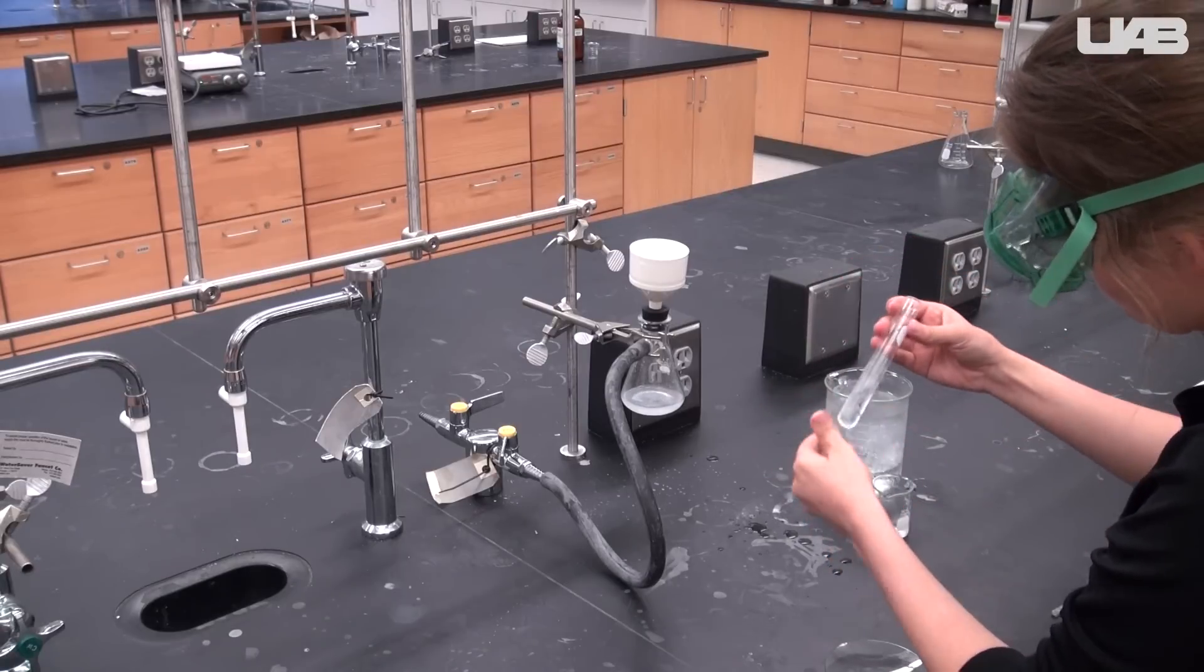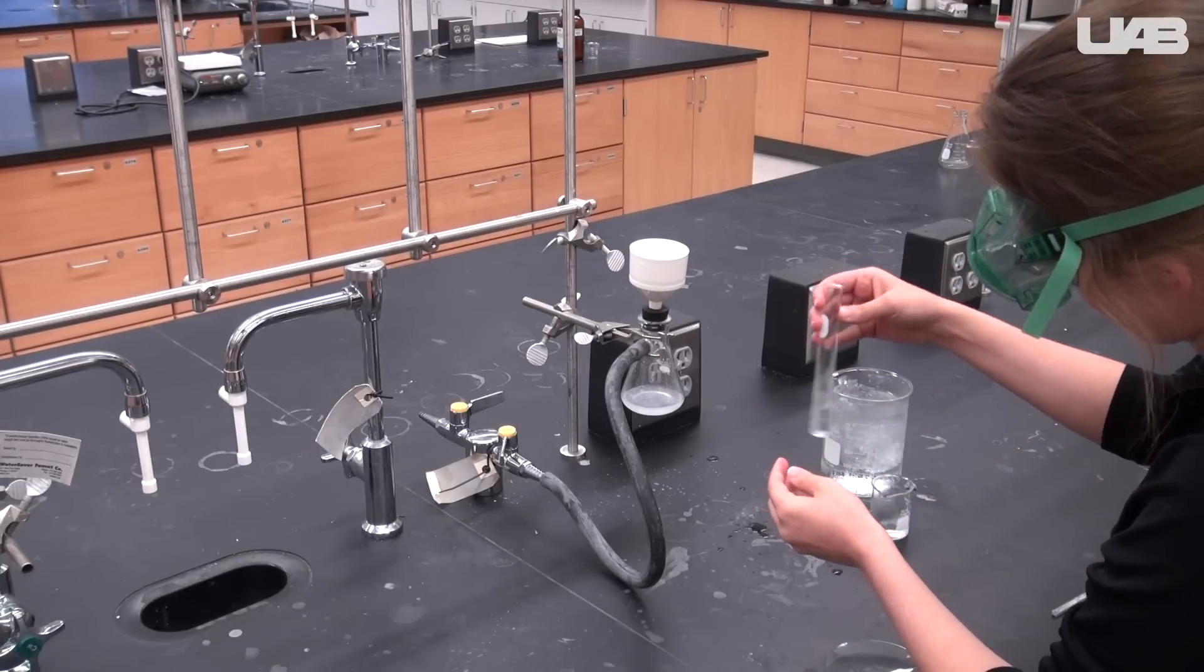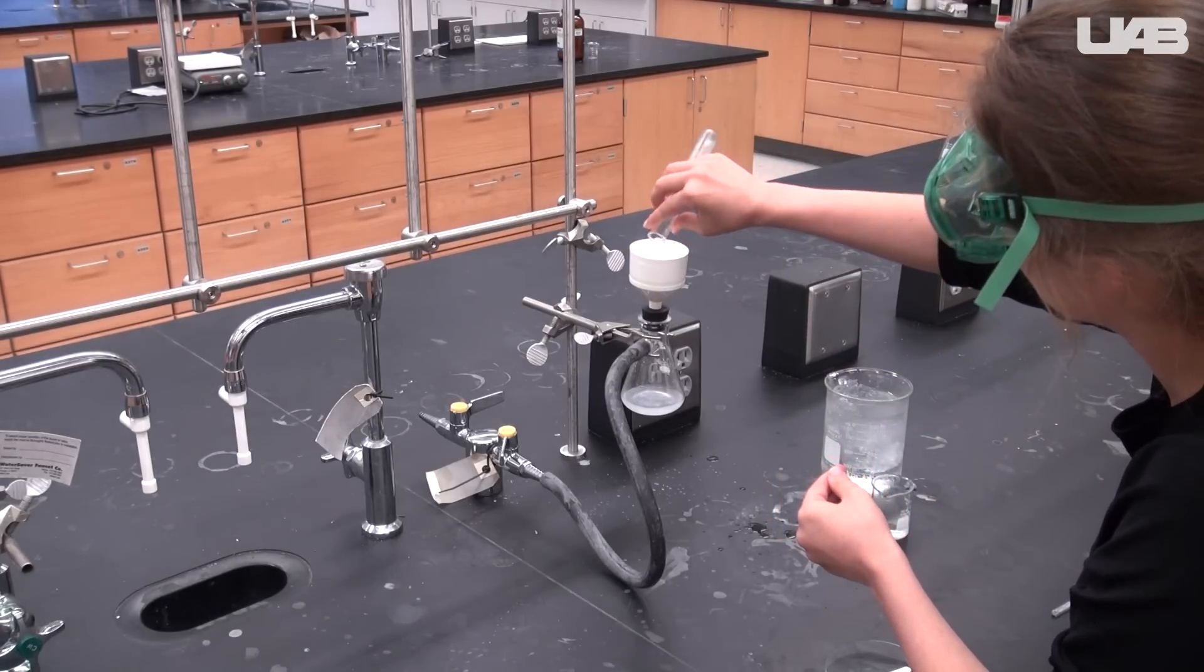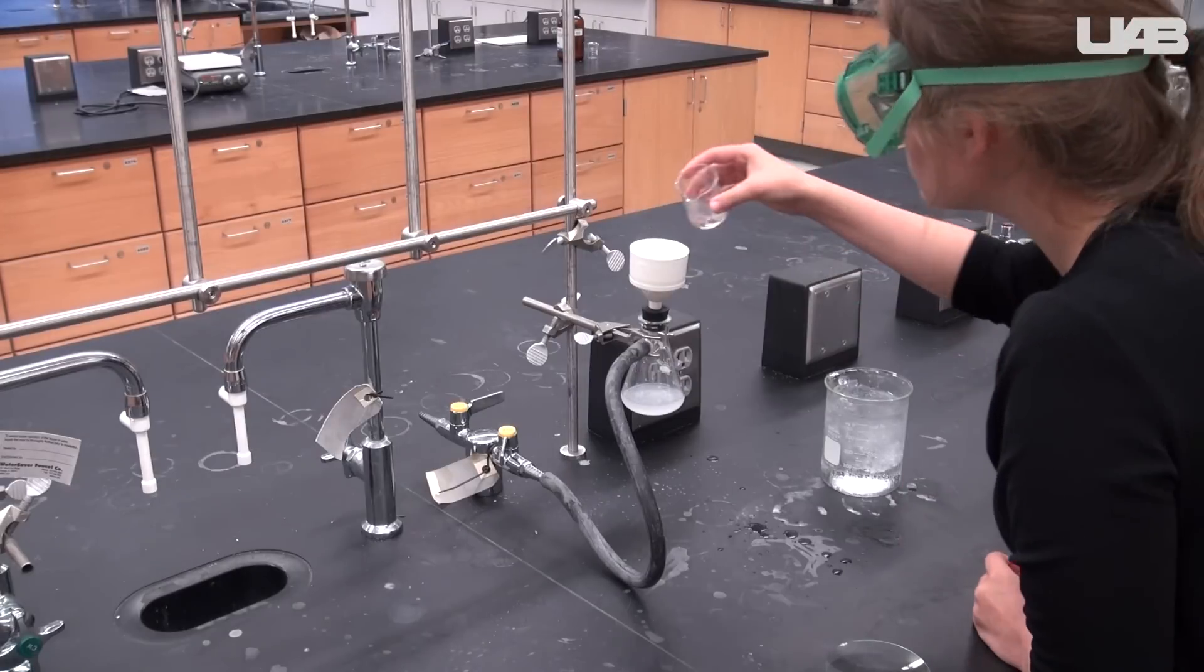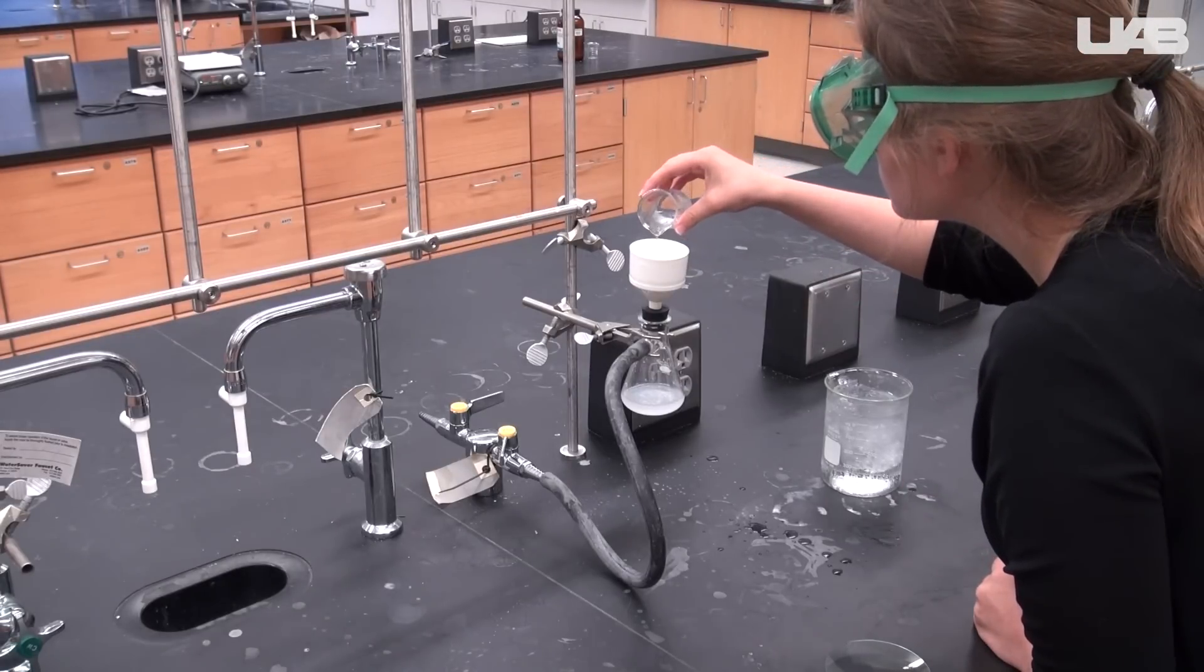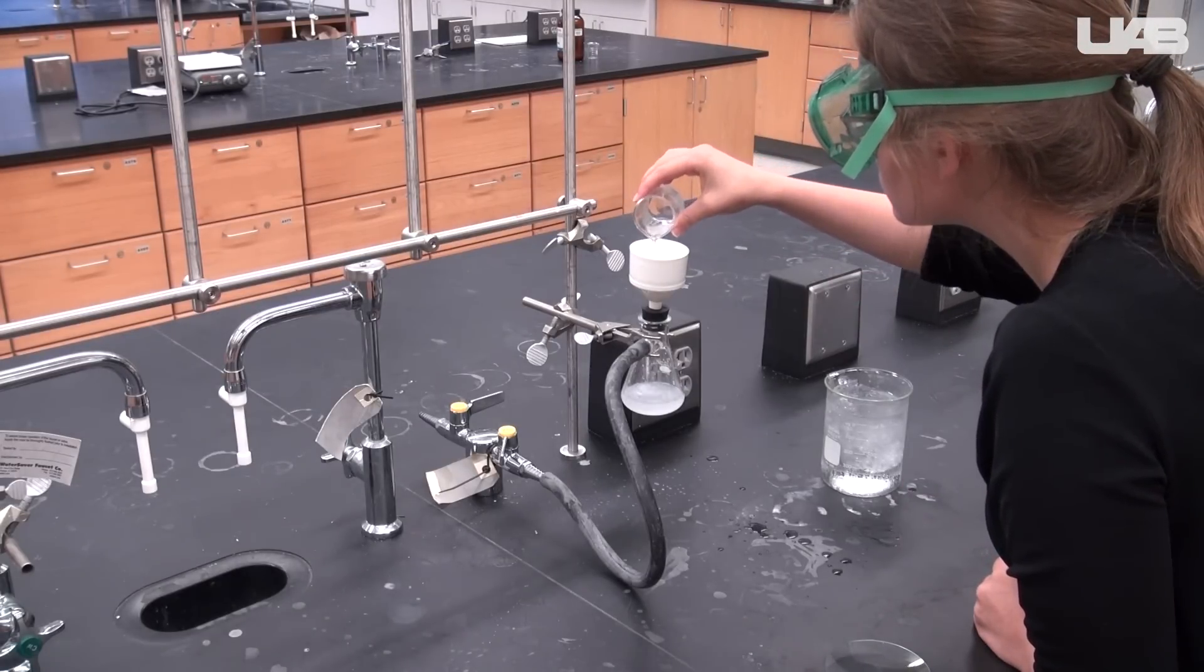You will use portions of the chilled distilled water to wash out any remaining crystals from the test tube. Use small portions of the distilled water to wash the crystals. Continue to pull air through the sample until it is dry.